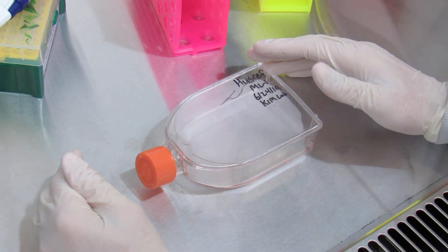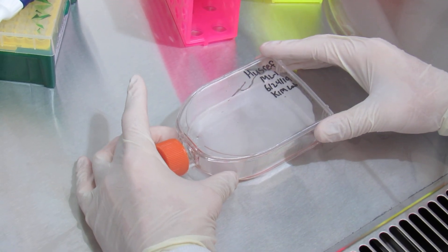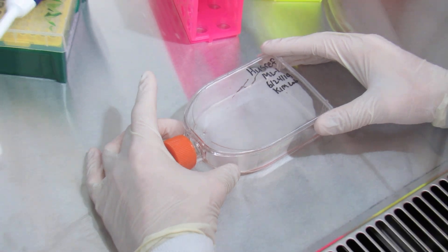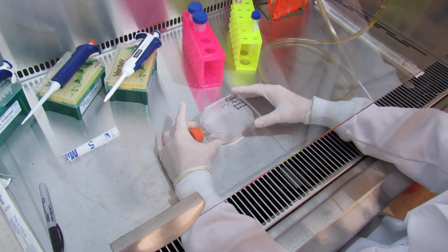After you've done this, you're going to move your 25 centimeter cubed flask and you're going to set it in the incubator for 15 minutes.